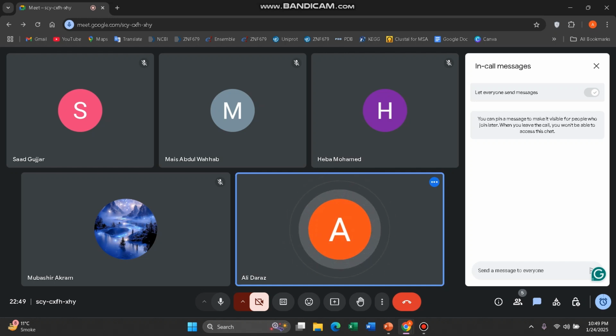The last part of the NGS is data analysis. It's actually about the bioinformatics tools, where the actual data analysis will be done. We'll talk about the data analysis of the NGS in the next workshop, but in today's workshop we'll talk about an overview of it. I think no one has a question about the filtering and annotation, so we continue to the next part of the workshop.